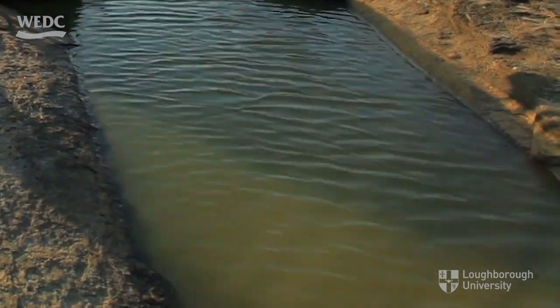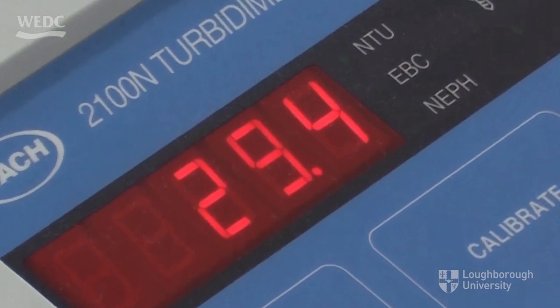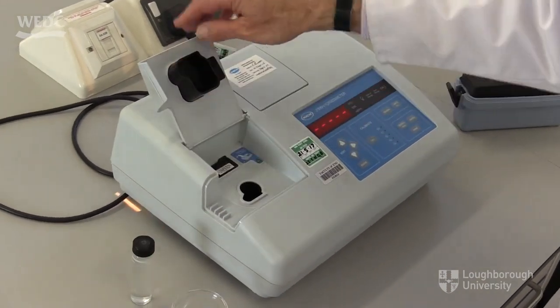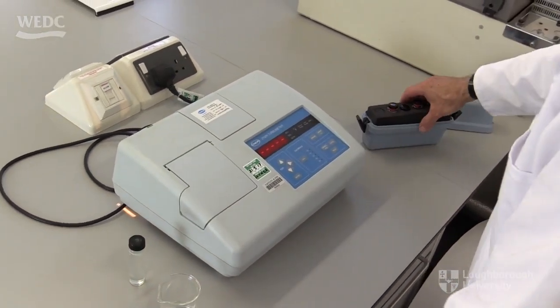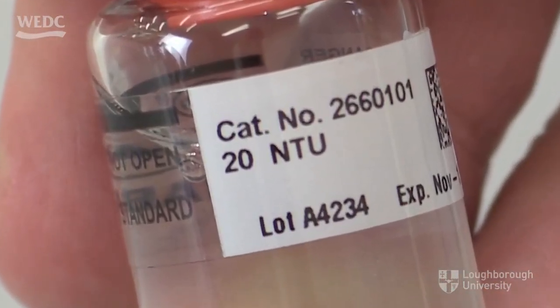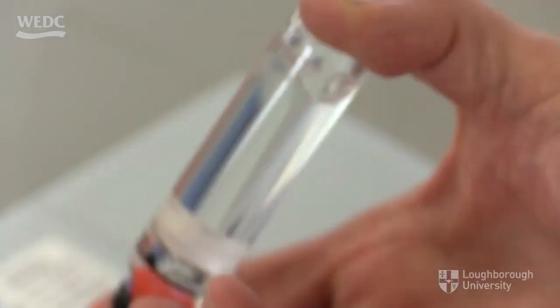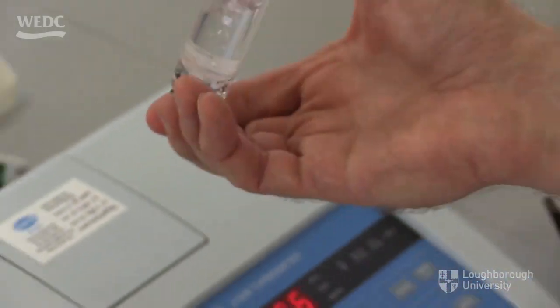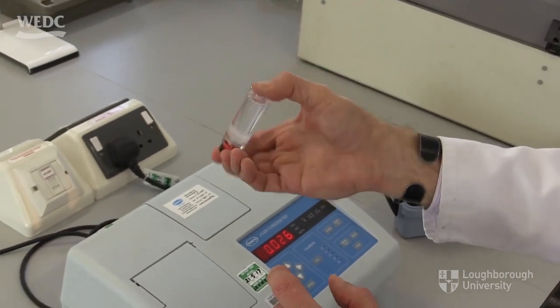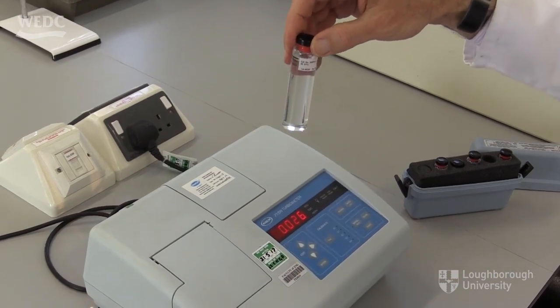To check that the meter is calibrated correctly, and therefore to validate the reading for this sample, take the sample out of the machine and check the turbidity meter using one of the boxed standard tubes, each of which has a different NTU value. This particular standard tube has a turbidity of 20 NTU. First, shake it well to make sure that the material causing the turbidity is evenly distributed. Let it stand briefly for any bubbles to disperse and also clean the glass.